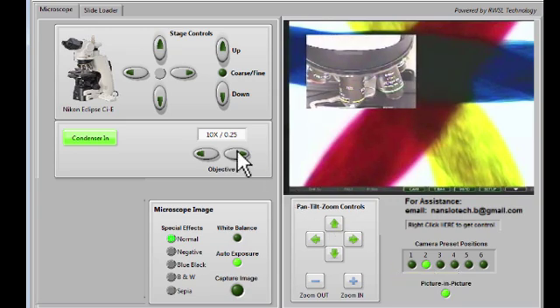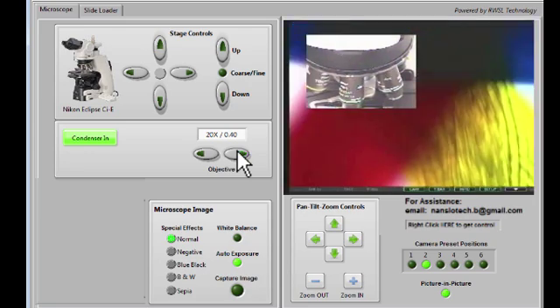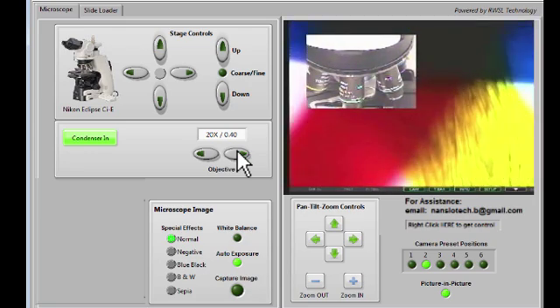And when we change objectives, we see them change in the picture-in-picture camera.